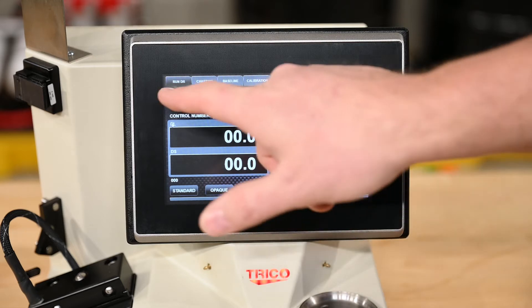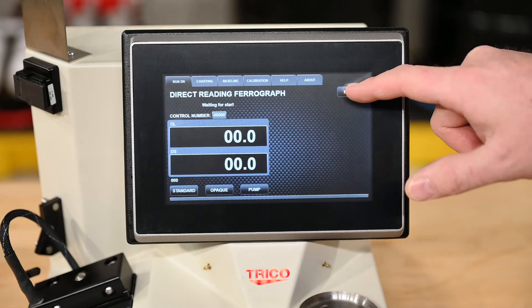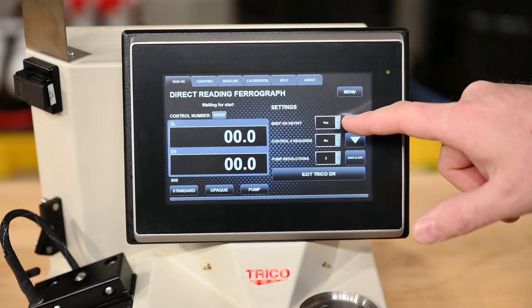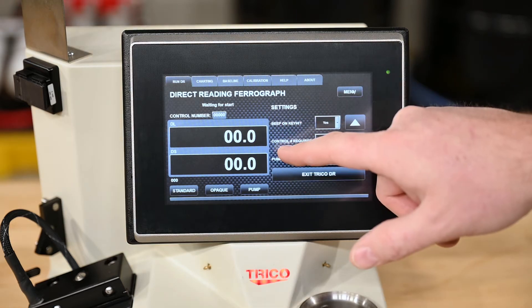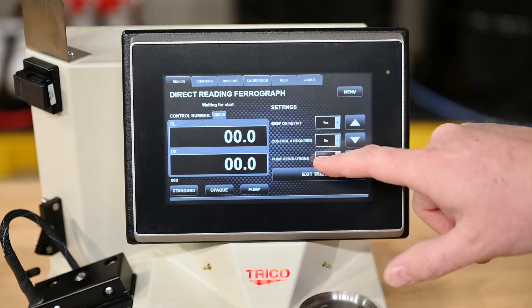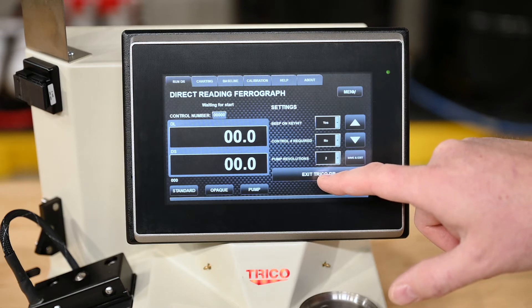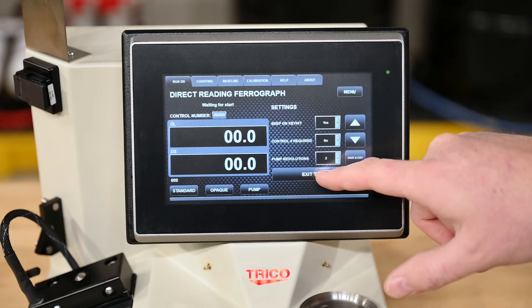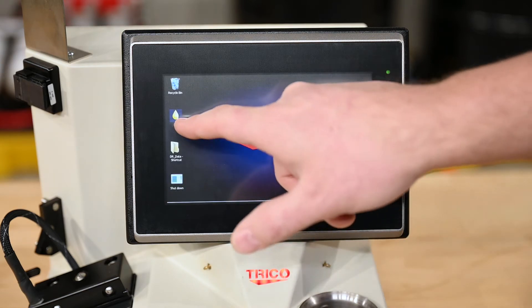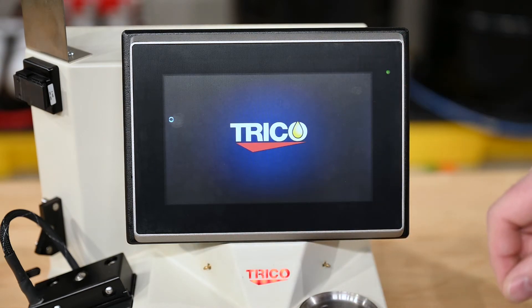Now I'll talk about the different tabs on the top of the screen and what each button functions for. If you touch the menu, your options are to turn the beep on and off for every input, to select whether or not you want a control number, and to adjust the pump revolutions on the peristaltic pump. You also have the option to exit the DR program. If you select exit program it closes the program, and to start the program back up there's an icon you double touch and the program restarts.